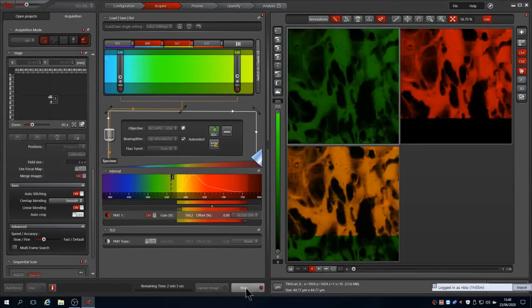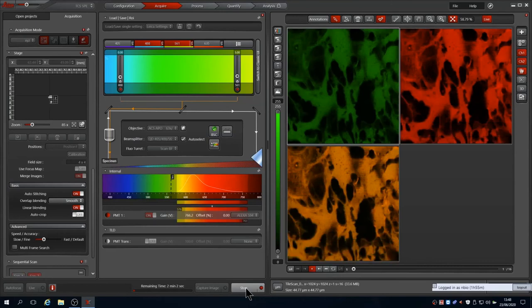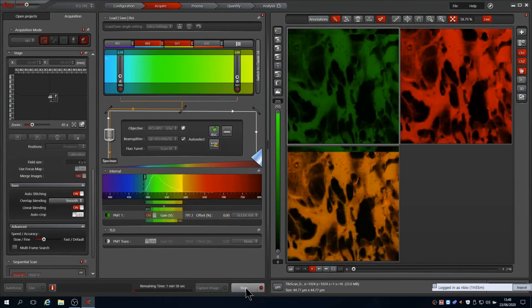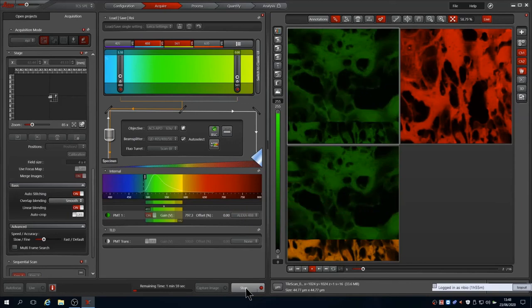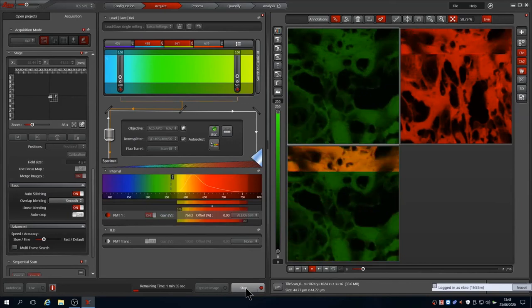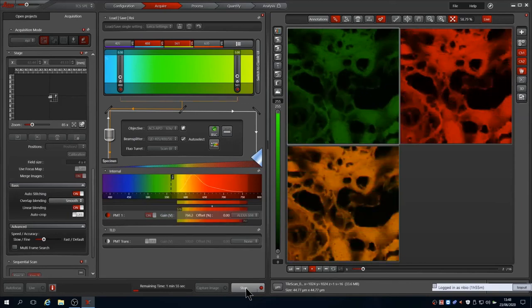Now pressing Start captures multiple images over the area. These are shown as a series, with a slider beneath the image viewer. These are stored as a single file containing the multiple locations.